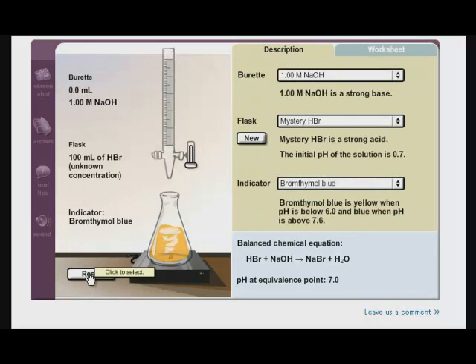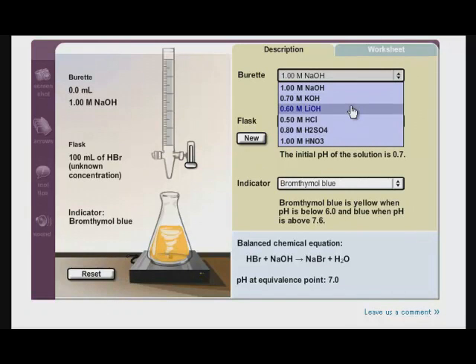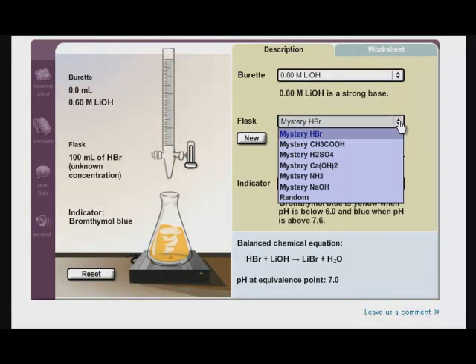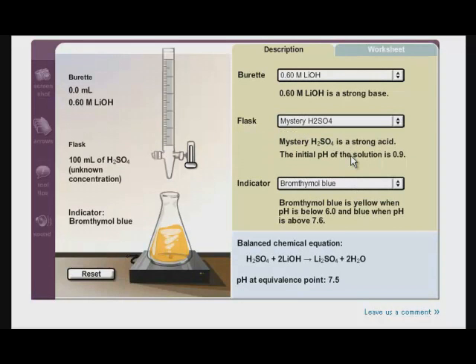And I can go ahead and reset, start over again. I can choose a different titrant and a different unknown.